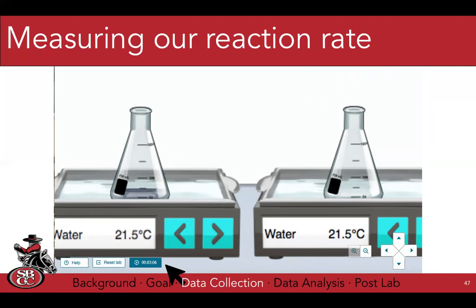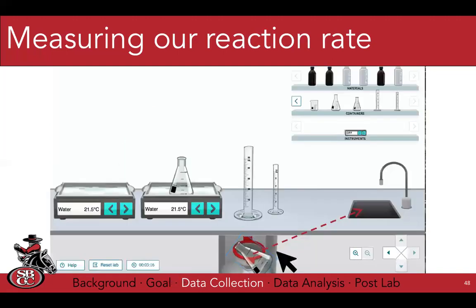It changes over a few seconds, and how quickly you can spot that will determine how accurate your exact number is. But because we're looking at a series of values, a series of rates, and the slope, the math works out really nicely, and we'll all end up having the same orders for our P's and our Q's.